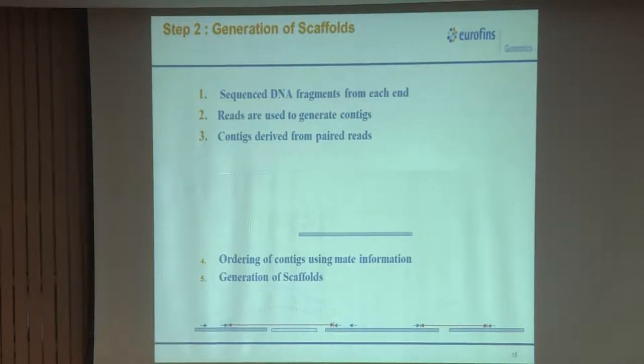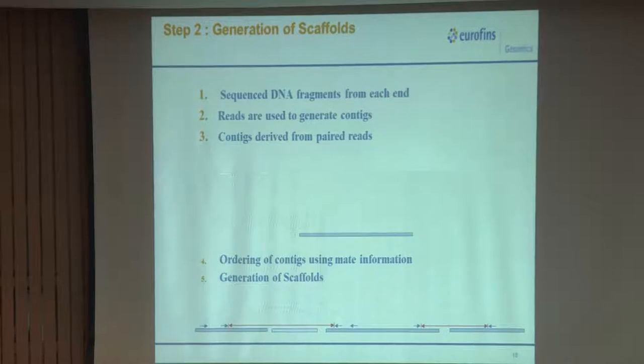If you're doing it for a job, that depends again. If you're using one software and you have optimized it, you can use it. Now there are softwares which use both the algorithms, like MaSuRCA uses both the algorithms. So you eliminate all your errors of assembly at least. Then you go for gap filling with different softwares, so they will again fill up. Then you have different libraries like MatePair, PacBio and all. Those can fill up these scaffold ends in between. You can use longer reads and insert sequence information which will fill up.